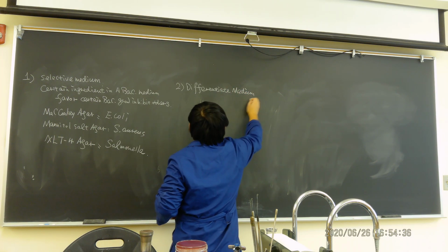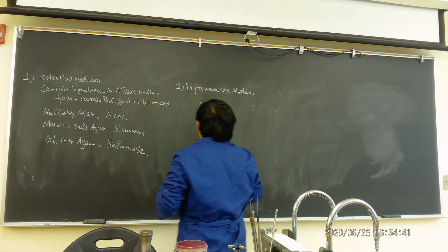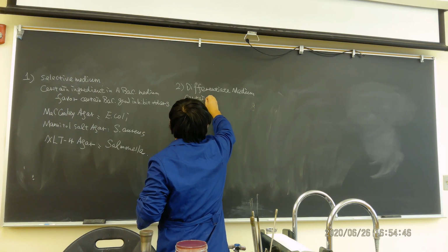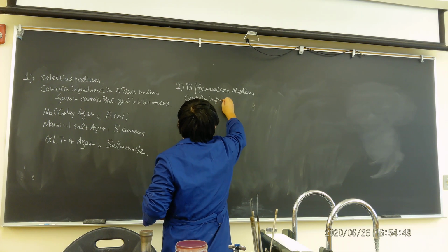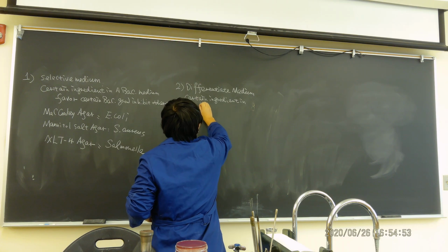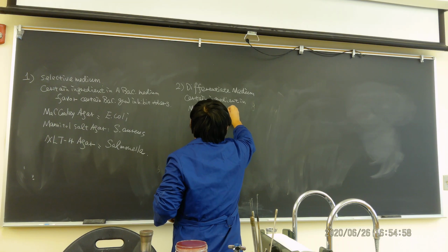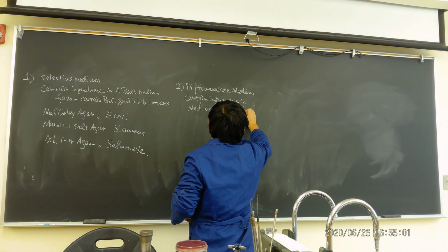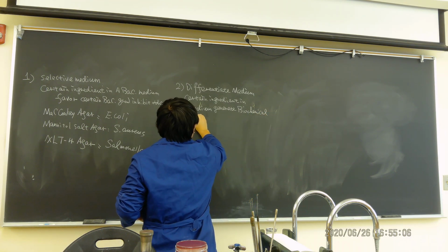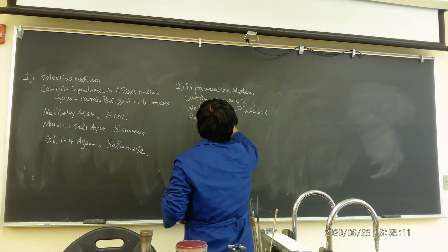Differentiator media means there are ingredients in this medium which will generate a biochemical reaction that can differentiate the bacteria based on the color.